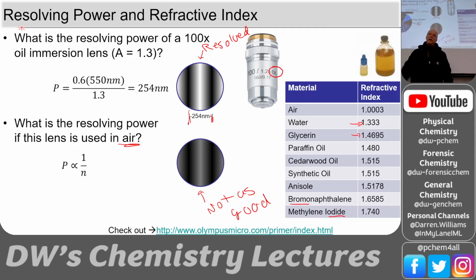And when light comes in, it's like walking through Jello. It's interacting with all of those charged particles. And you could think of it as instantaneous absorptions and re-emissions. So the electron starts to oscillate, and then it stops oscillating and spits out the photon of light again. And then it hits another electron, which oscillates, and then it spits out the photon again.